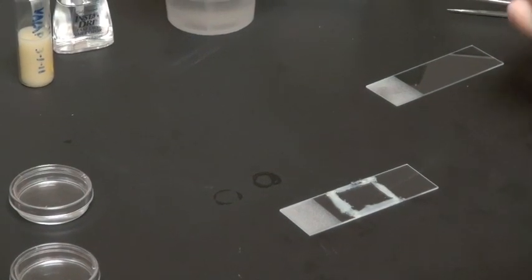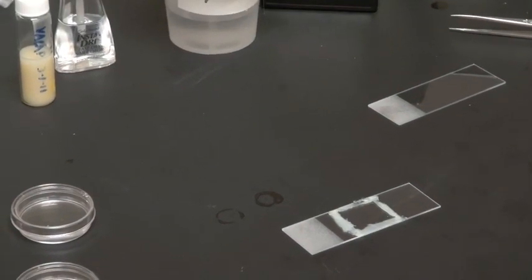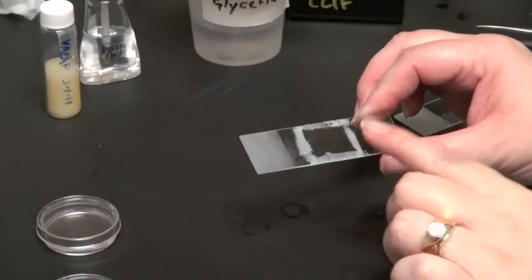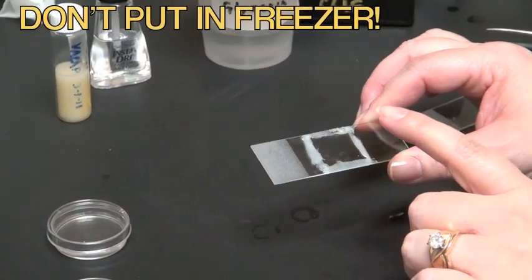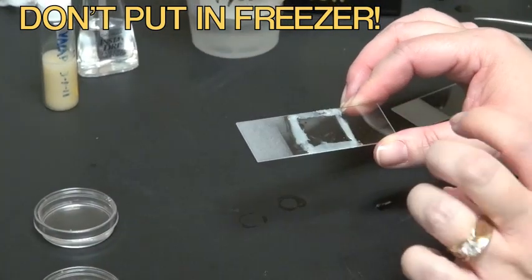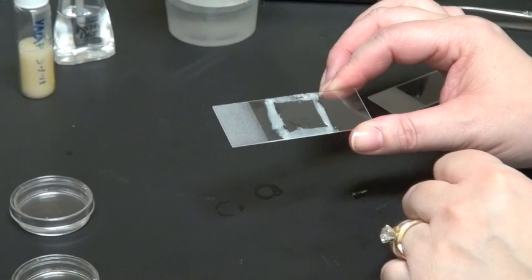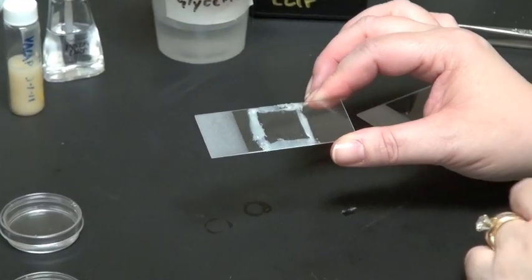Now, the important thing to understand about Valap is that this is fine to go into the refrigerator, not fine for the freezer. This wax will crack and break on you. So if you want to keep this for a longer time, you can keep it in the refrigerator. And that's how you do your cover slip.